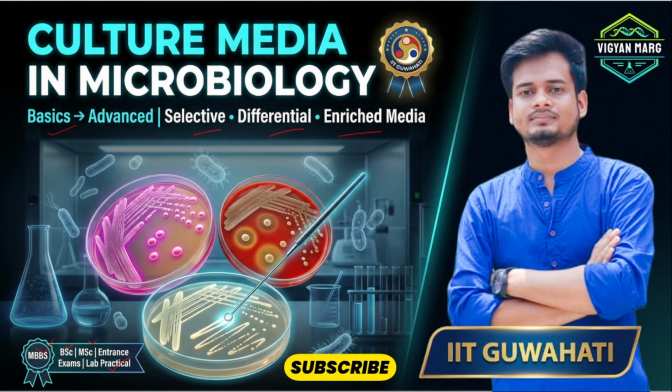So grab your notebooks, because by the end of this video you will be able to choose the right medium for the right organisms and for the right purpose. So let's begin our journey into culture media in microbiology.